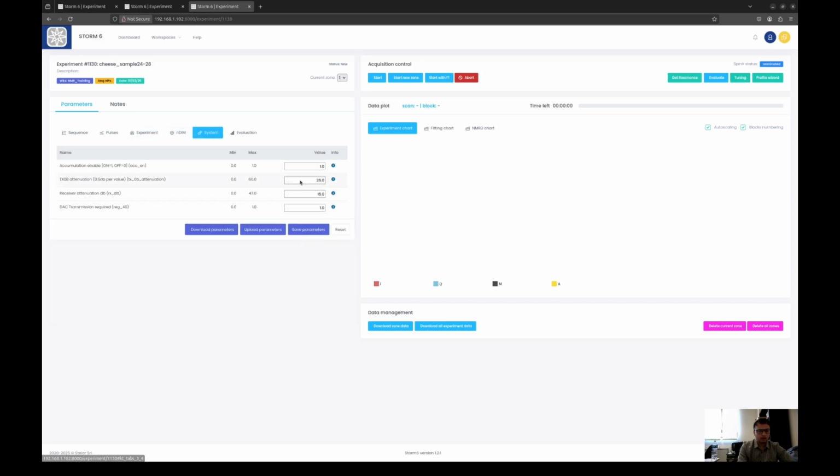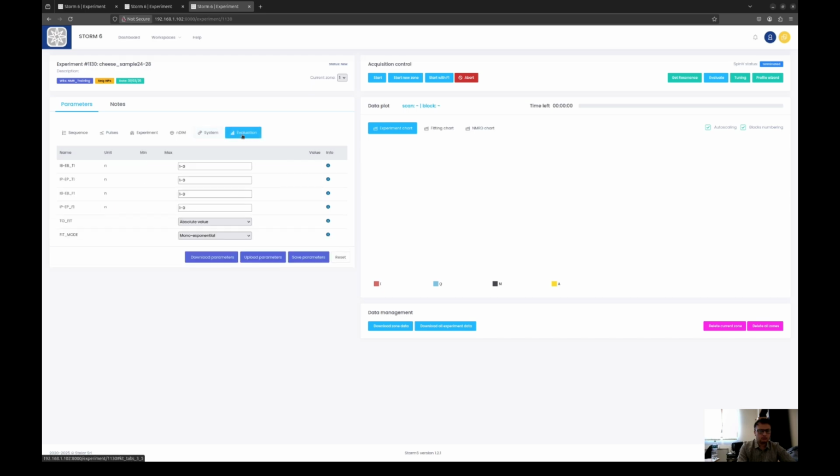And then other things are okay. This we again have to make consistent, so 22 and 0, and these are again okay. So as a first step we will do mono exponential fitting. So here we can see it's mono exponential, it's absolute value.